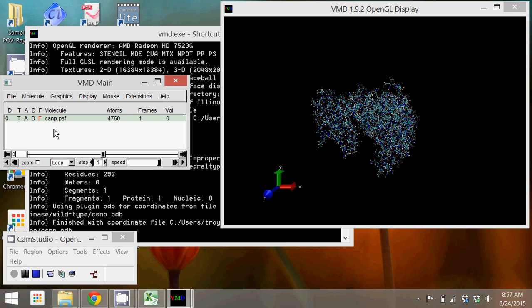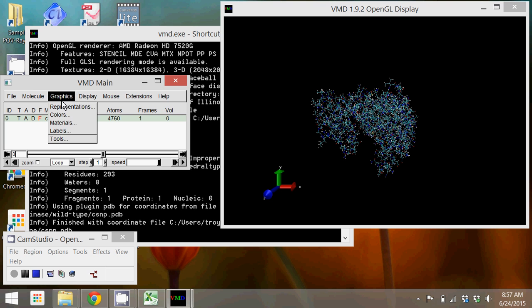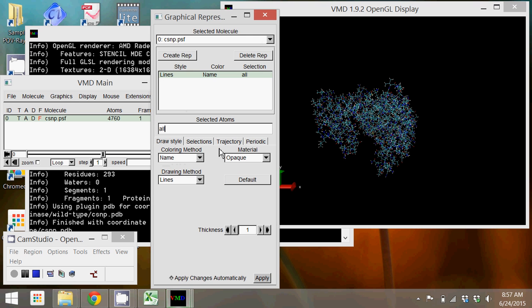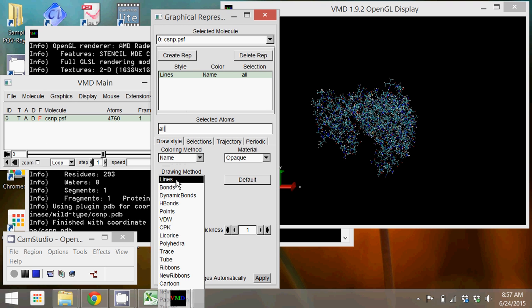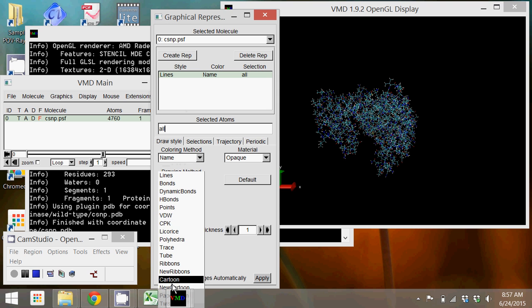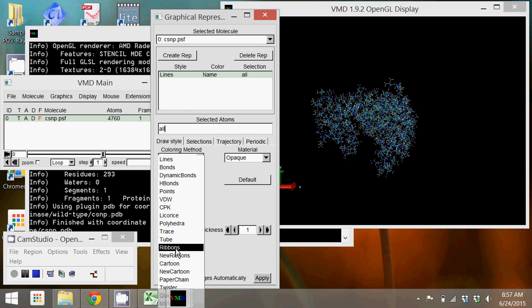And just because I like to see what the structure looks like, I'm going to change this to new cartoon so I can see the ribbon structure that this has.